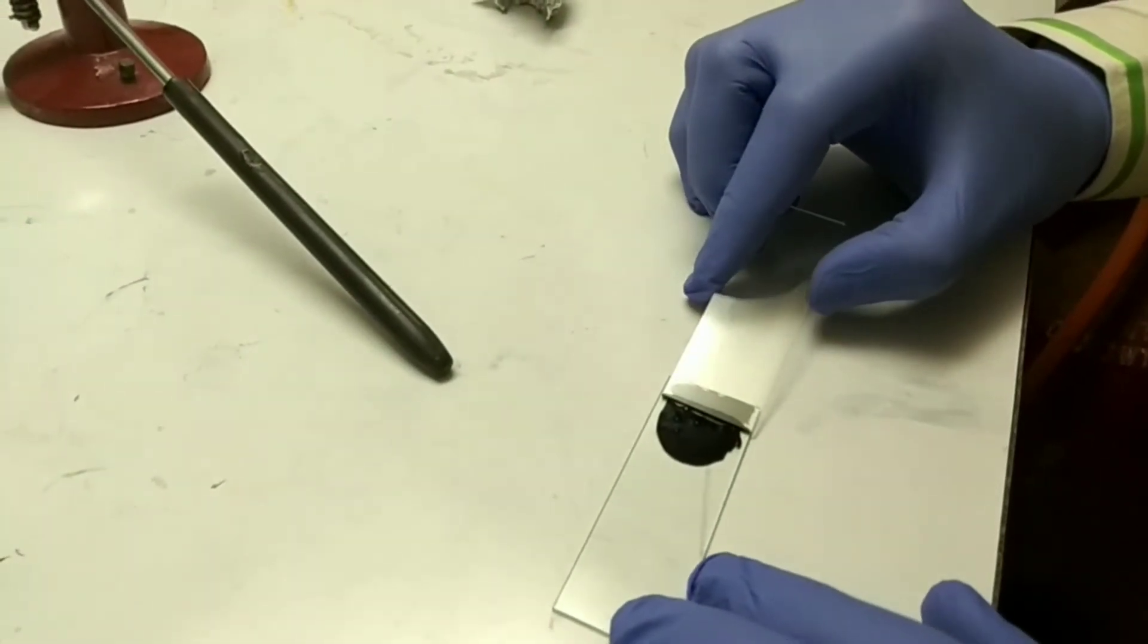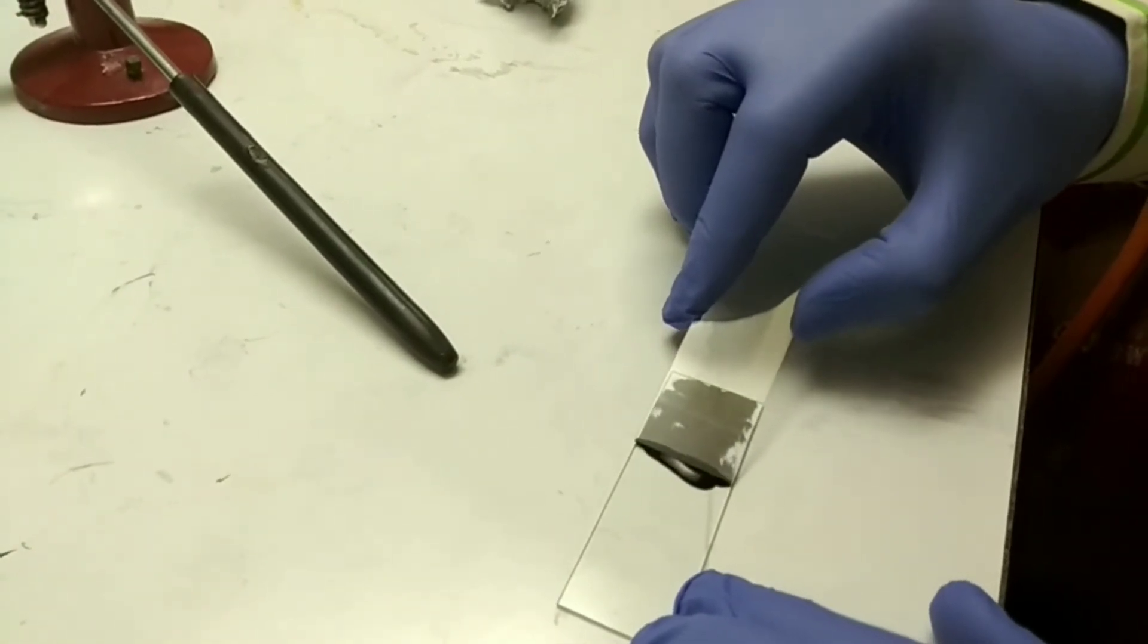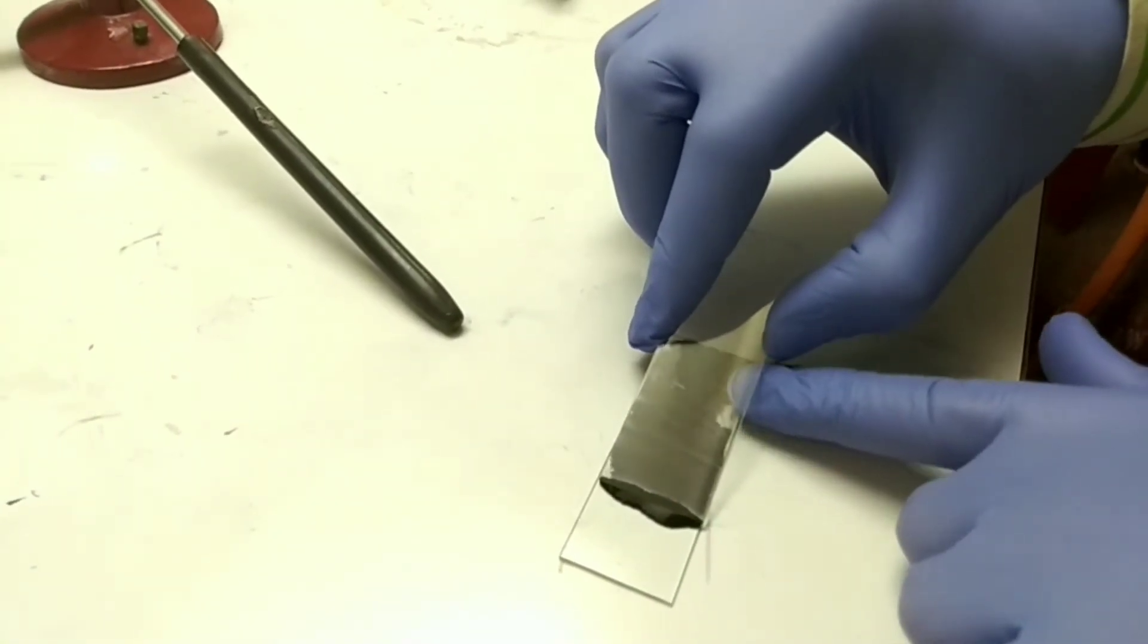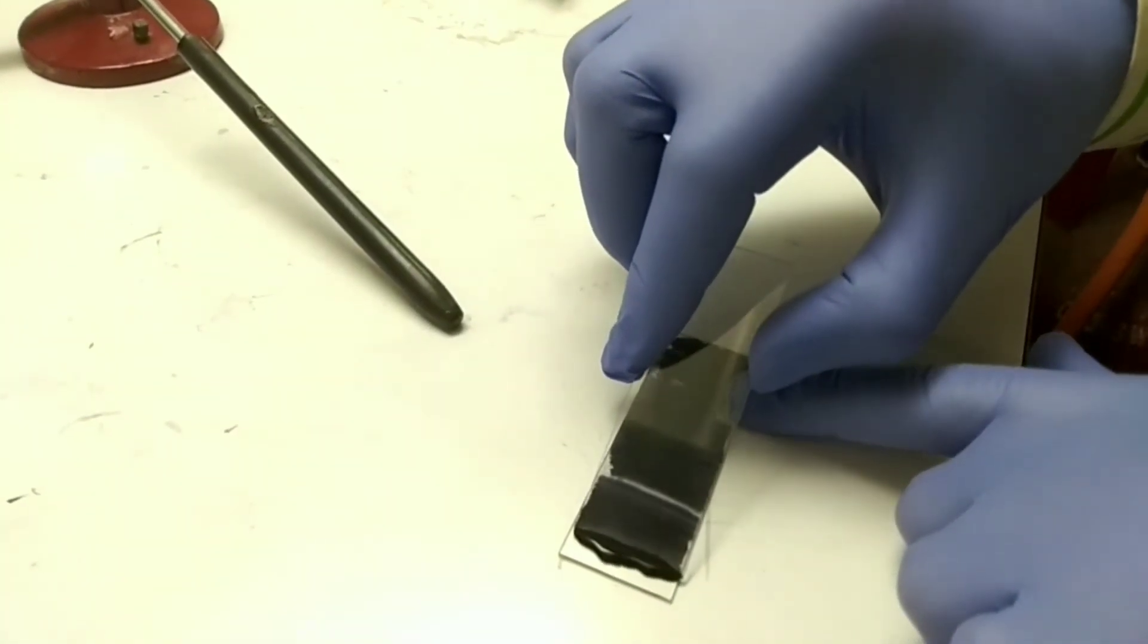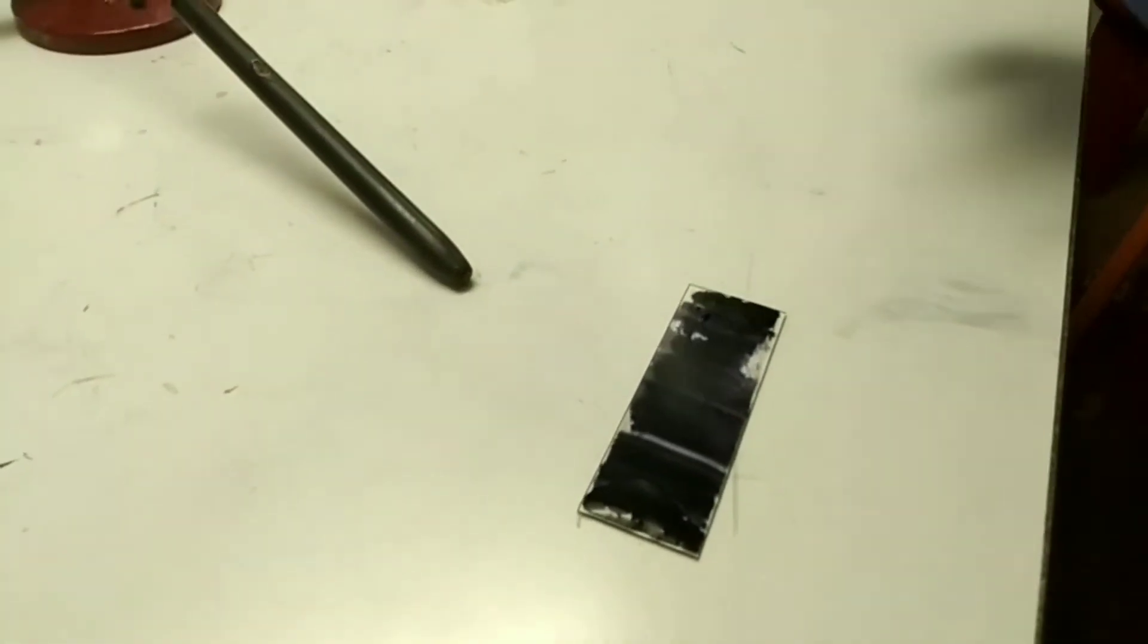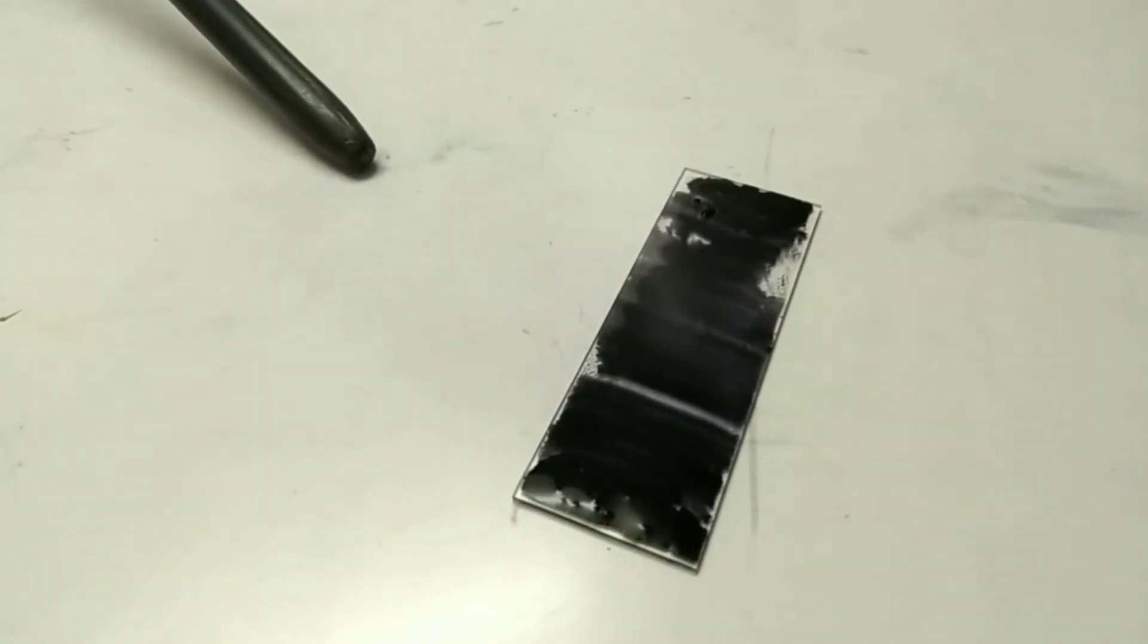After properly mixing, we have to make a film from this nigrosin and culture mixture. Keep in mind that you have to make a thin film so that you can observe the microorganisms and their capsule in a proper way under microscope. After that, air dry the slide. Don't heat fix the slide because heat fixing will melt the capsule and you won't be able to visualize the capsule properly.